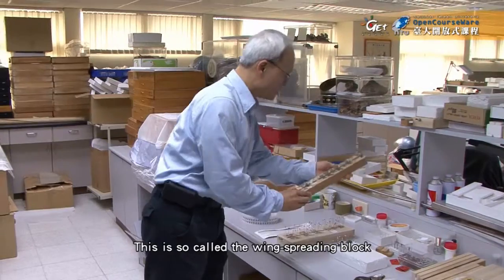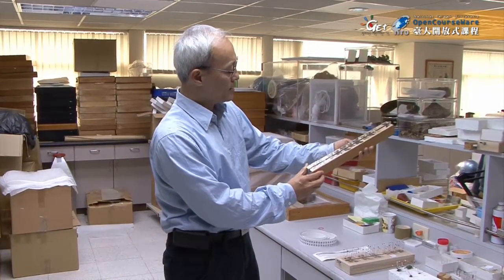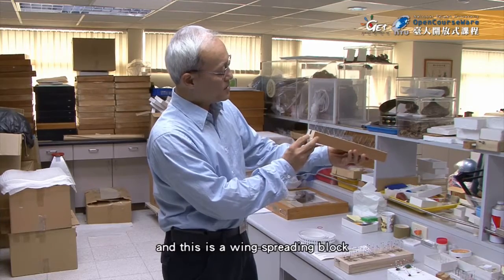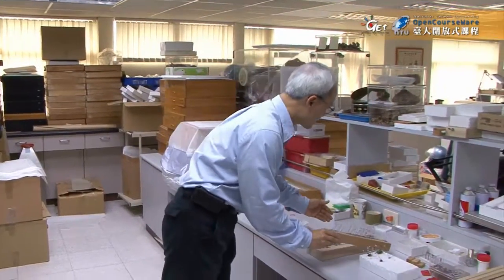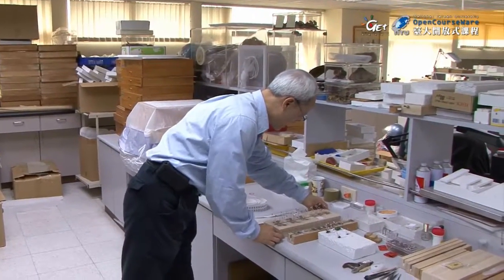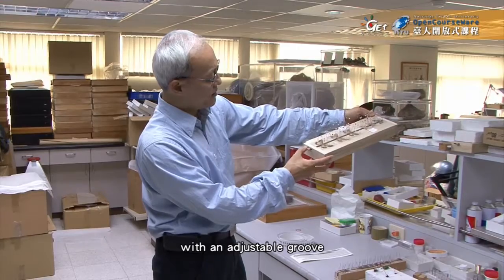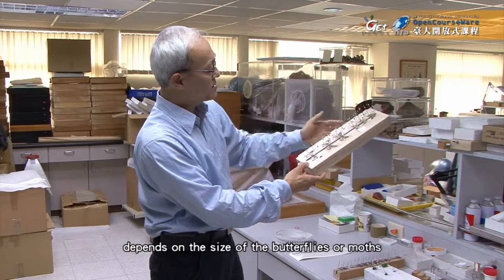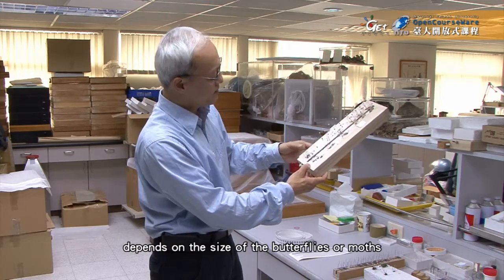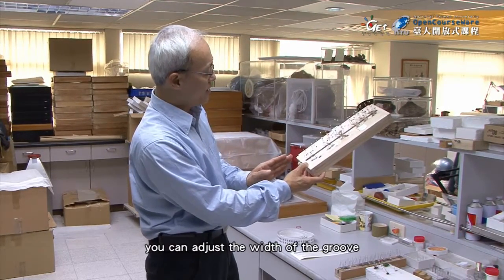This is a so-called wing spreading block, and this is a wing spreading block with a fixed groove. And this is a wing spreading block with adjustable groove, so that depending on the size of the butterfly or the moth, you can adjust the width of the groove.